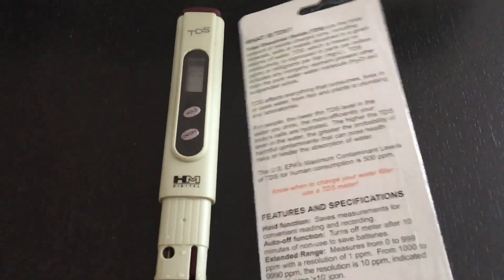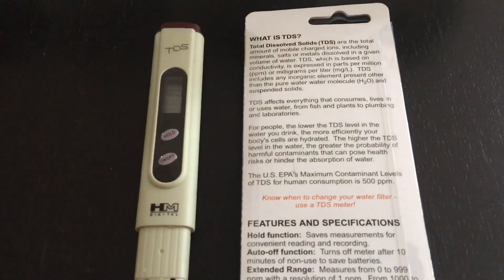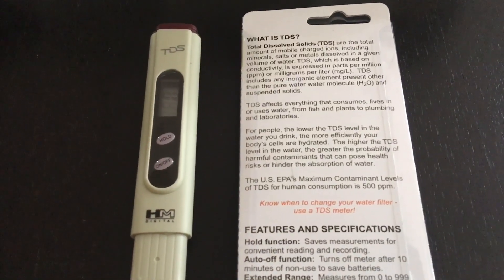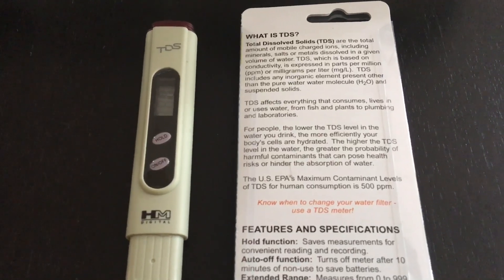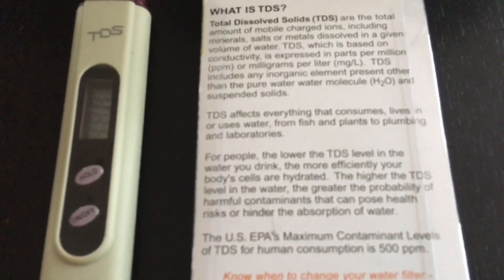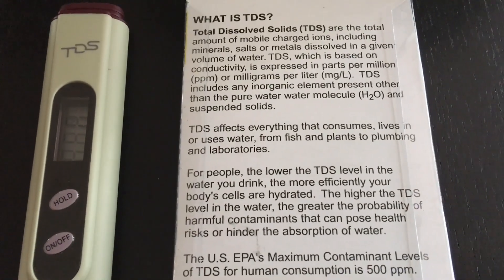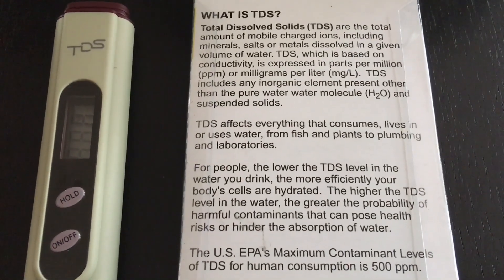You may ask: what is TDS? Well, the packaging is great — it gives you a real overview. TDS stands for total dissolved solids found in water: different minerals and things that can be harmful, especially for fish. The packaging notes that TDS affects everything that consumes, lives, or uses water — from fish and plants to plumbing and laboratories.